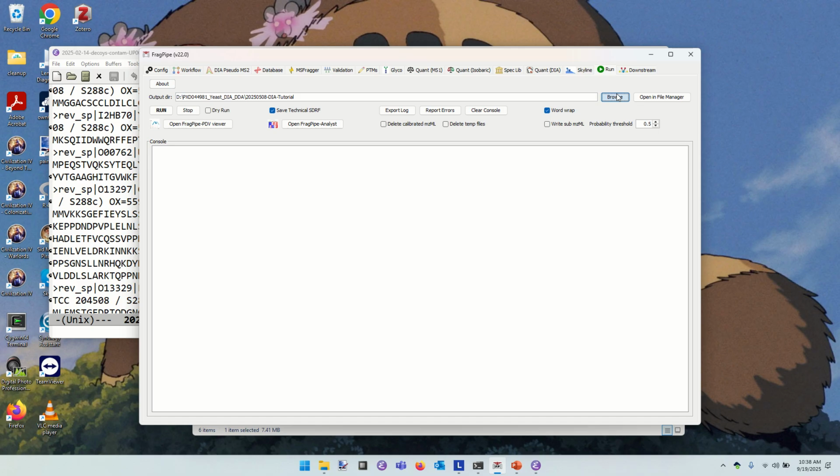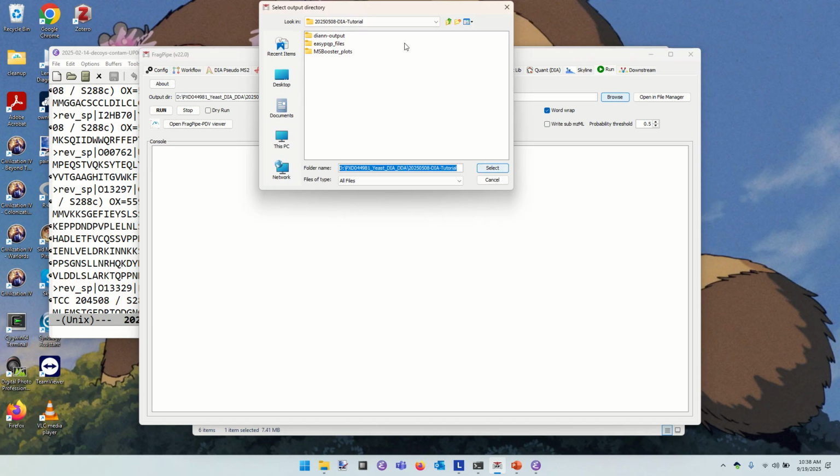Now here, I need to specify where I'm going to save my result. So I'm going to go back to where I installed the files on drive D, GJAM training, part A, and I'm going to just create a folder in here, and I'm going to call this training run 1.